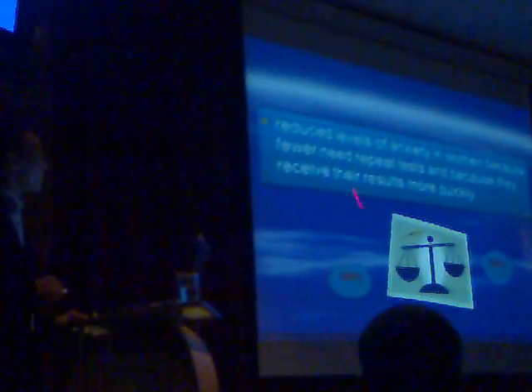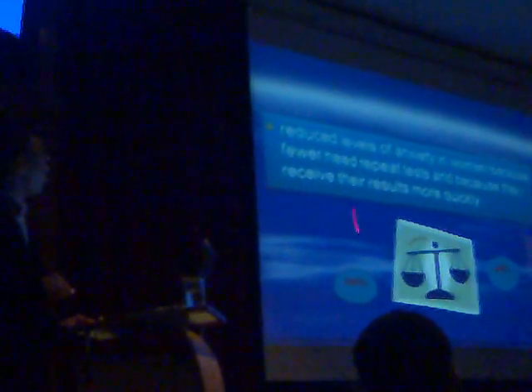When I do a traditional pap smear, only 20% of the cells are taken from the cervix to the spatula and from the spatula to the slide. 80% of the cells are lost, while 100% of the cells are taken from the cervix to the container in the case of LBC, and this will give a better result.